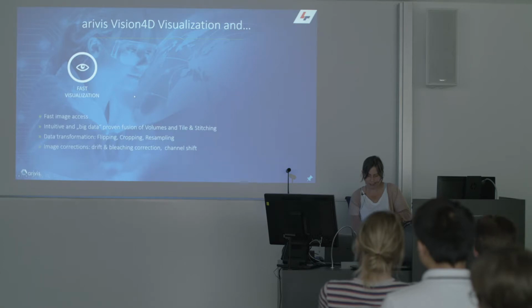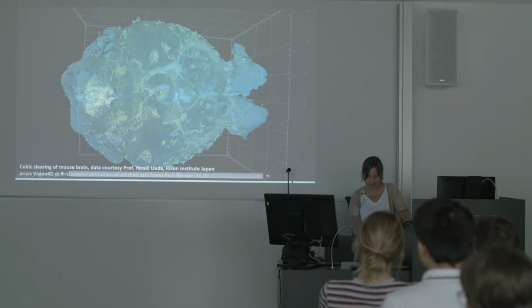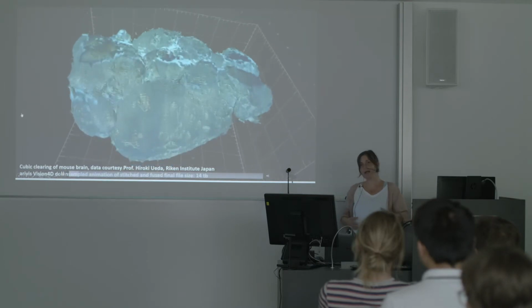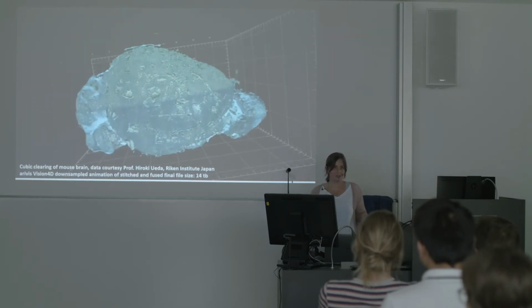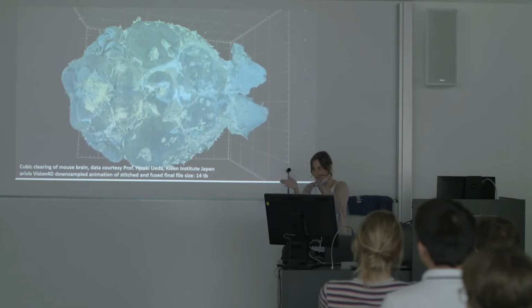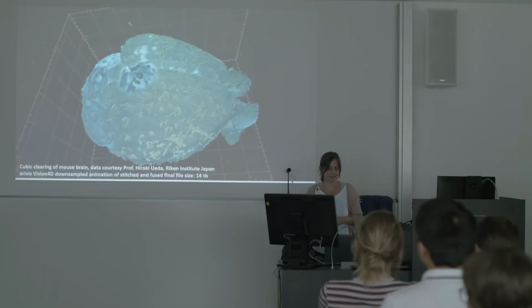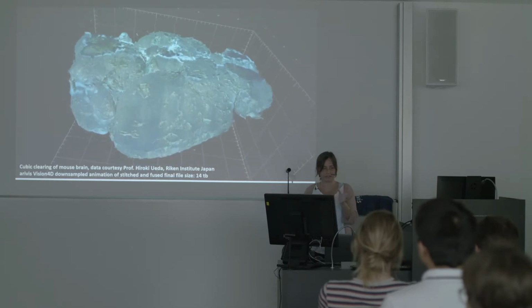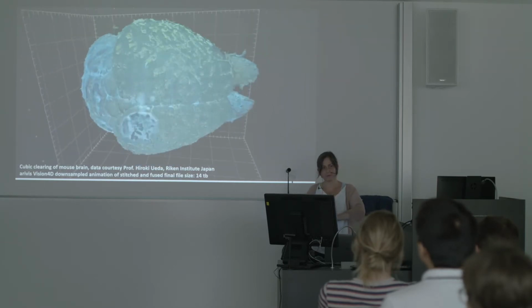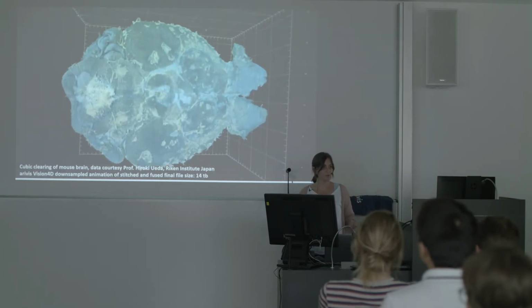So the visualization also includes, to a certain extent, providing you with a tool to manage the future, because you are now starting with the clearing, or you may have started, and your future will be that you end up with 500 gigabyte or 1 terabyte data sets. At some point you have to look at the data, and at some point you want to share it with your colleagues, and you do so by following this particular workflow.